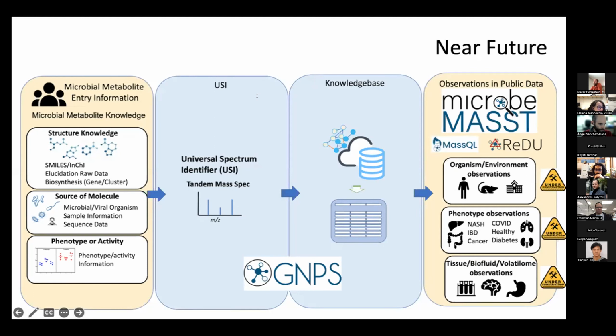What these mass search tools allow you to do is identify the data sets where you putatively have changes, because in principle, the frequency of detection is related to the intensity of the molecules. It's called spectral counting, but it will only find really large changes. So you can use it essentially to find data sets where these metabolites are found. Then you can go back and reanalyze those data sets, do feature extraction and all those manipulations, and then draw your box plots or do your statistics on it to see their relative intensities. So it's not as easy, and it will not be that straightforward. But on the other hand, without these search tools, you wouldn't even know that those data sets existed.